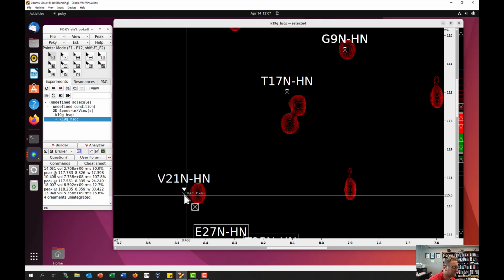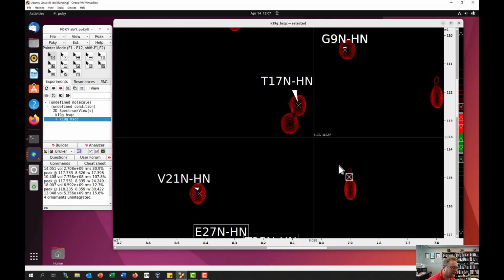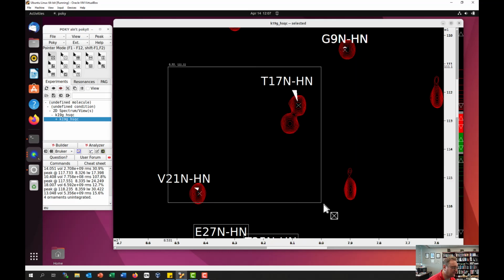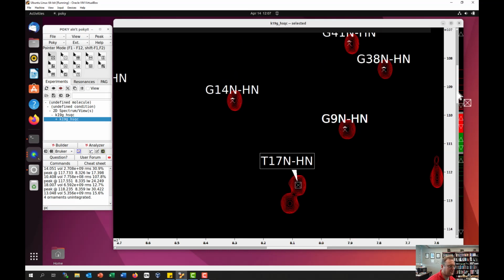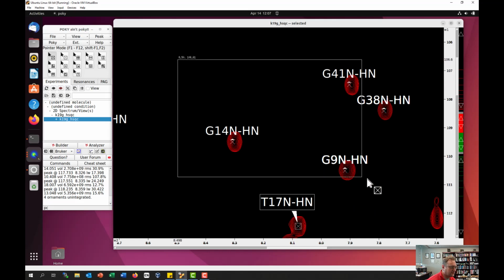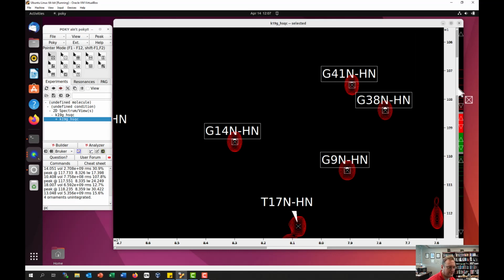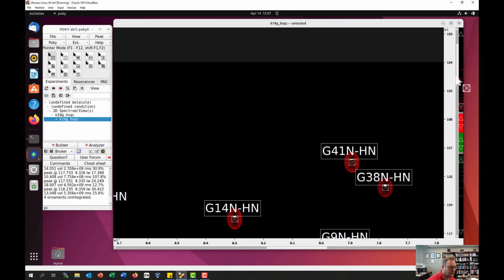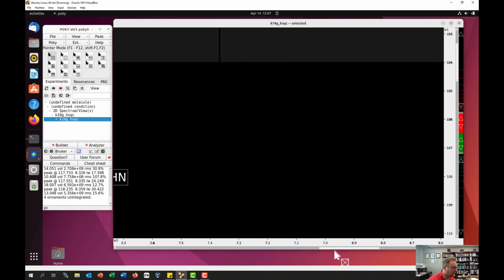Okay, and so now we're starting to see additional peaks coming in here. So these are unassigned because they represent asparagine side chains. We'll look at those in a bit. And if we go up and we continue selecting peaks, right? So we're just snaking through some more. And so again, now I'm going to bring 7.7 to the left-hand side of my screen. And now we're snaking down.